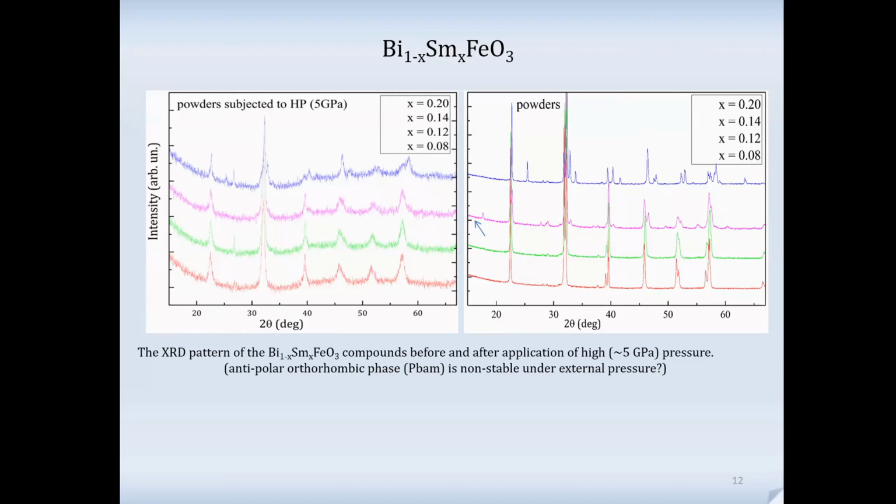But let's look at the particular reflections of the satellites, not the basic perovskite reflections. Say for a compound which is non-polar orthorhombic, mainly I would say the crystal structure remains the same. This is still orthorhombic, and we have some particular reflections which prove this.